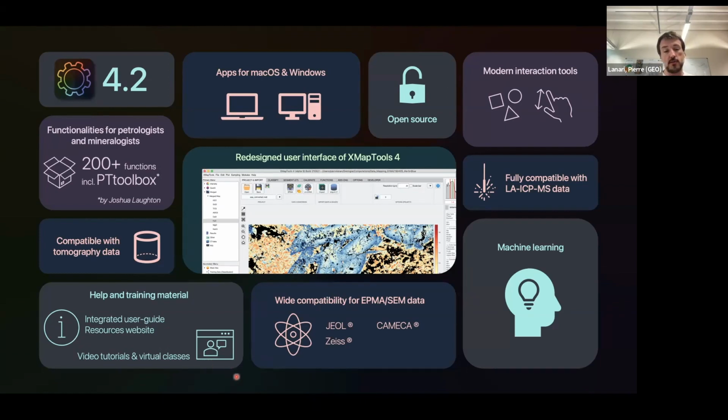And I'm working on developing the help and training material. It has an integrated user guide directly in the program. We have a resources website, and I'm producing now video tutorials and virtual classes.